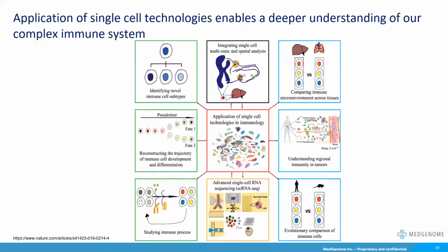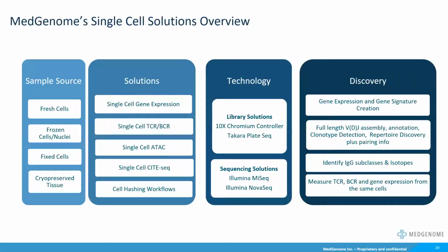With tumor oncology in particular, bulk genomic analysis and expression profiles of clinical specimens have shaped much of our understanding of cancer in patients. Human tumors, for example, are very intricate ecosystems with diverse cells. These include malignant cells, immune cells, stromal types of cells, whose precise characterization is often masked by bulk genomic methods, which are really still a dominant method used. With single-cell genomic technologies, these have appeared as a powerful way to dissect the human tumor level at the resolution of individual cells, and then provide a very compelling approach to deciphering cancer biology.